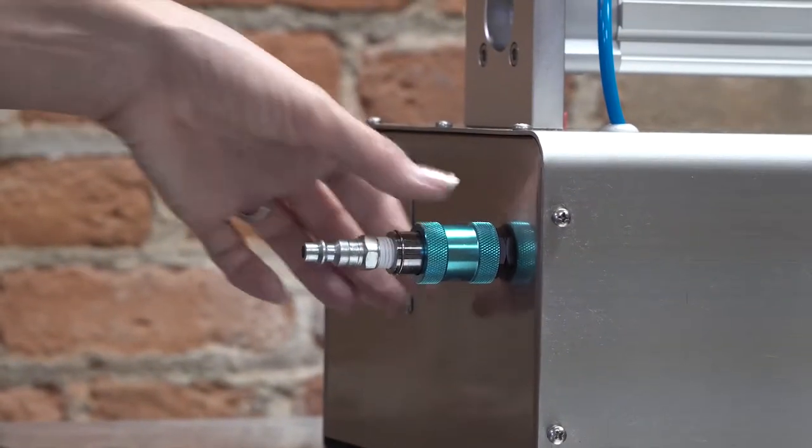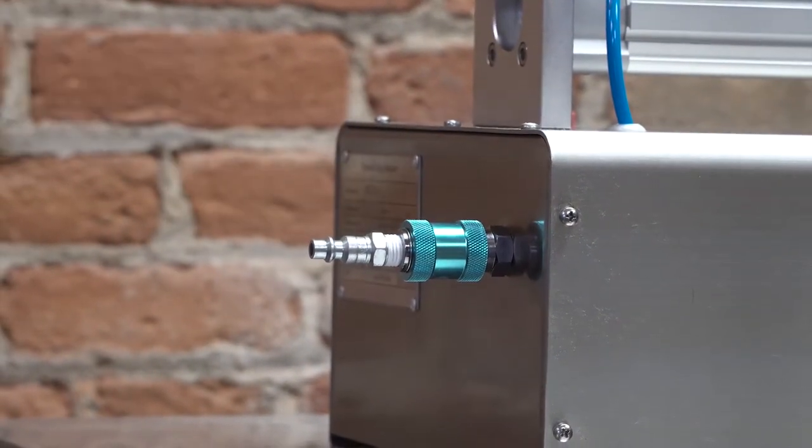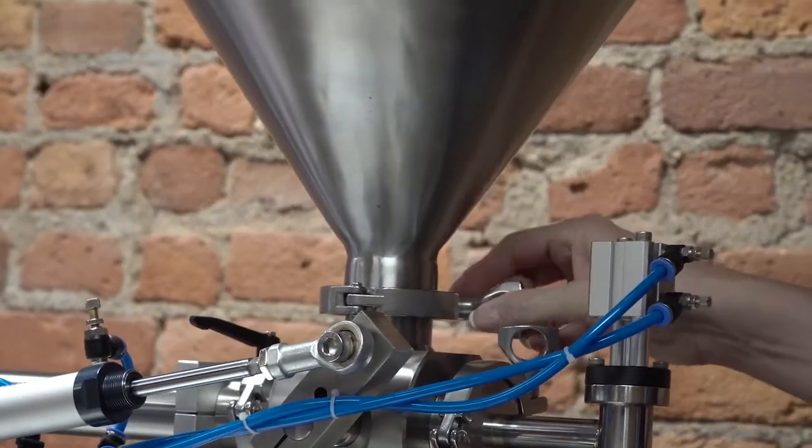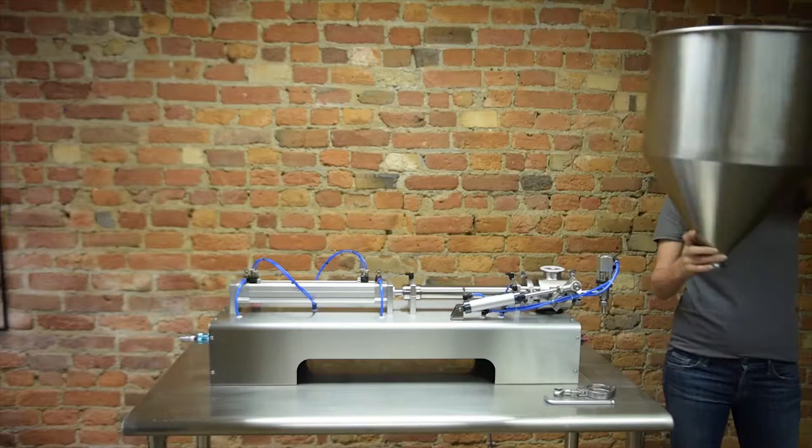Step 1, be sure to close the pneumatic slide valve, push in the emergency stop. Remove the hopper by loosening the sanitary clamp and set the hopper aside.